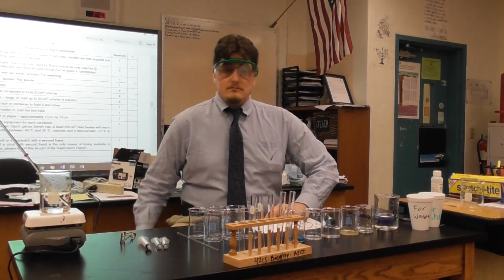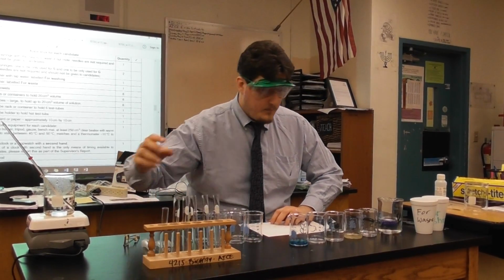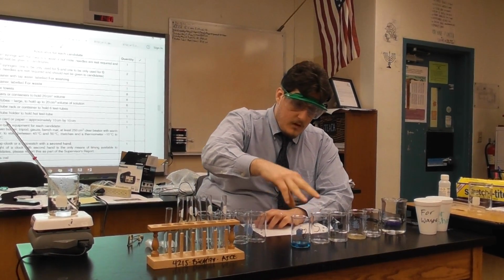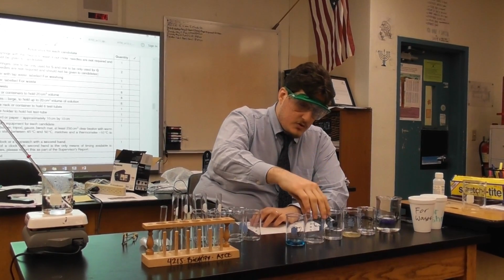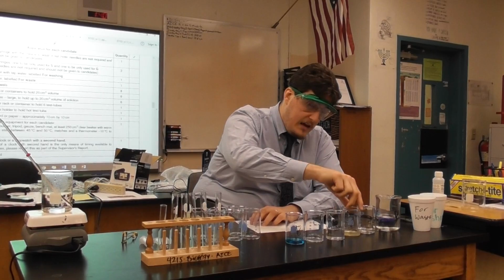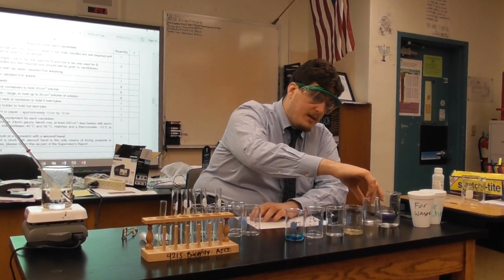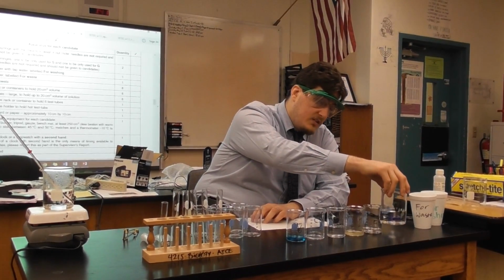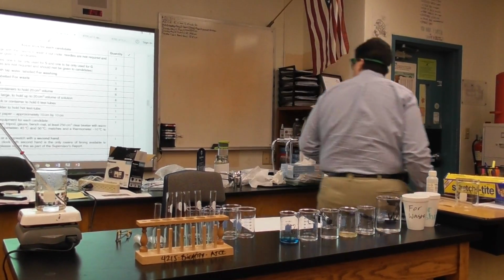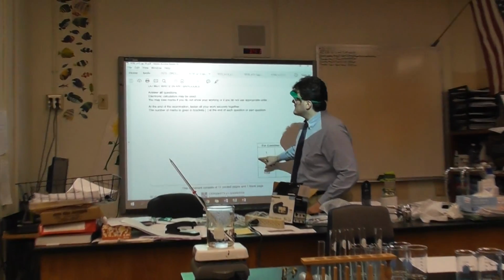Now, here's the deal. I also have here Benedict solution. I have starch solution, reducing sugar solution labeled G. I have an amylase solution labeled E1, an amylase solution labeled E2, a distilled water solution labeled W, and that is going to be my test.